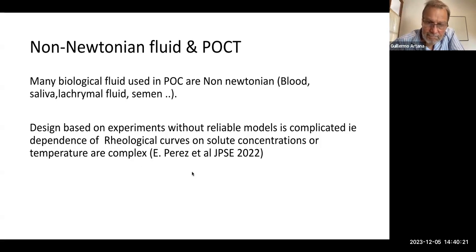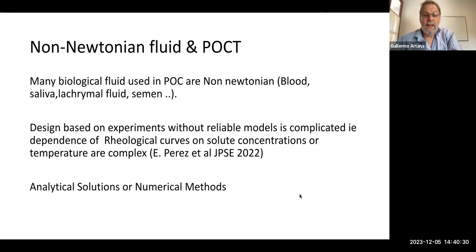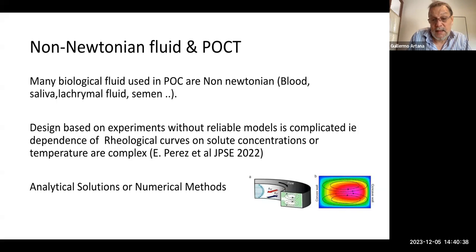So there are some limitations in the use of these kinds of fluids when you consider non-Newtonian fluids and paper-based devices.